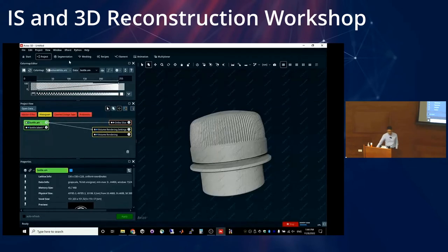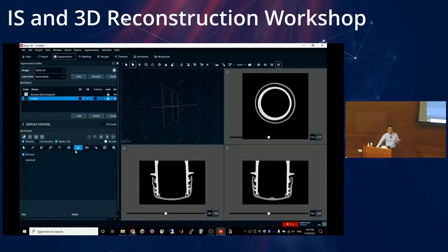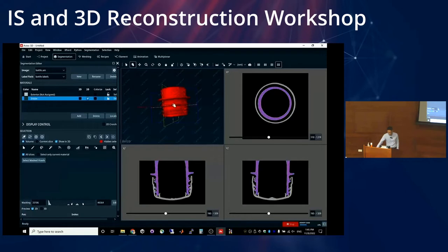All right, so again, I'll go back to my segmentation editor. Actually, maybe you're curious. You want to try thresholding, right? Because it looks like the intensity values are quite different. If you look at the histogram, you have these different peaks over here, right? So you can actually do that. So if I do this, for example, yeah, let's just try that. Okay, let me try that.